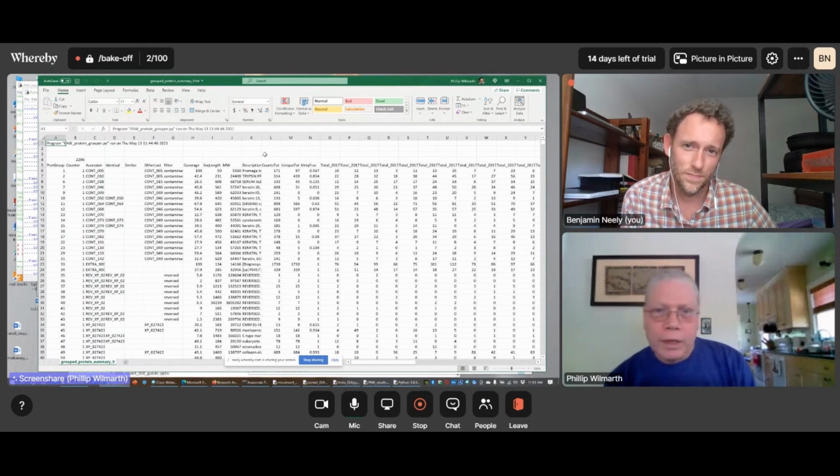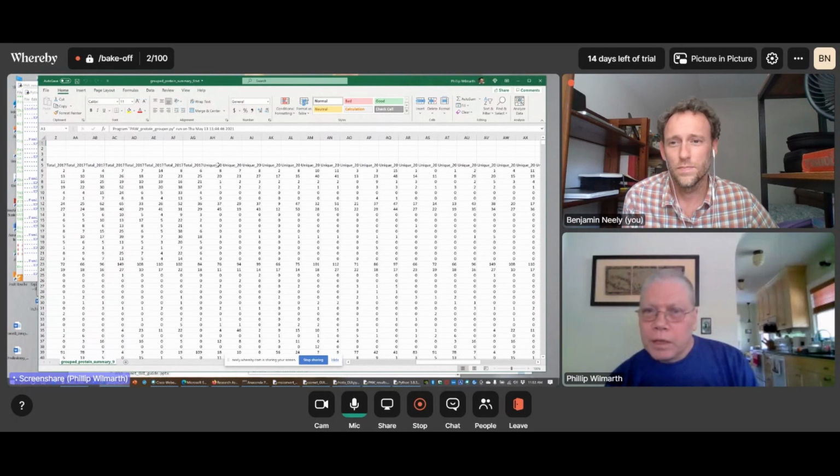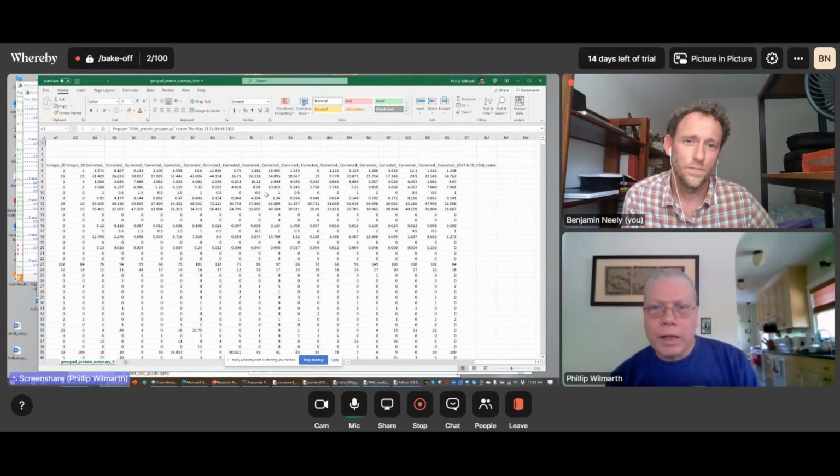And if we were doing TMT analysis with the pipeline, then there's steps where we can add in reporter ion intensities associated with all the different samples. We've got total spectral counts for the 19 samples. Then we've got unique counts for the 19 samples. And then we've also got these corrected counts where shared peptides are fractionally split based on relative unique evidence.